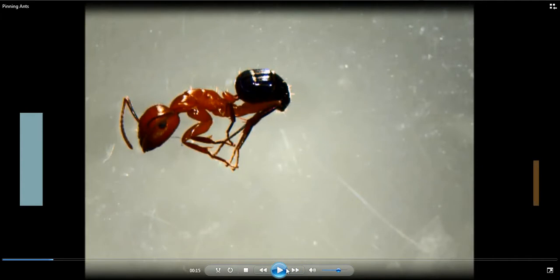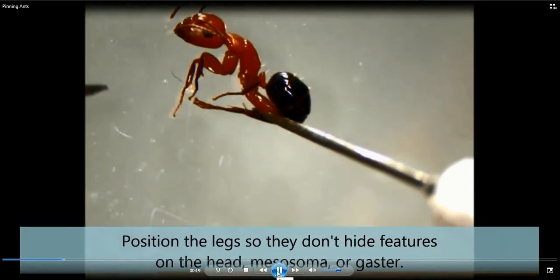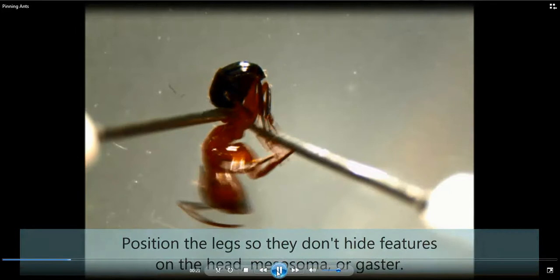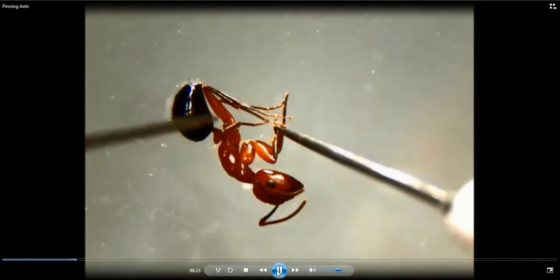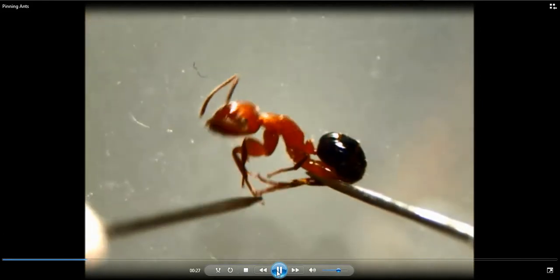This is a Camponotus — a carpenter ant. One way you can actually manipulate the legs is to use these little microprobes. These are actually little insect pins that are hot glued to the inside of a hollow Q-tip. You can see that you can move the legs around. It's a bit of a struggle, but you just have to be persistent.